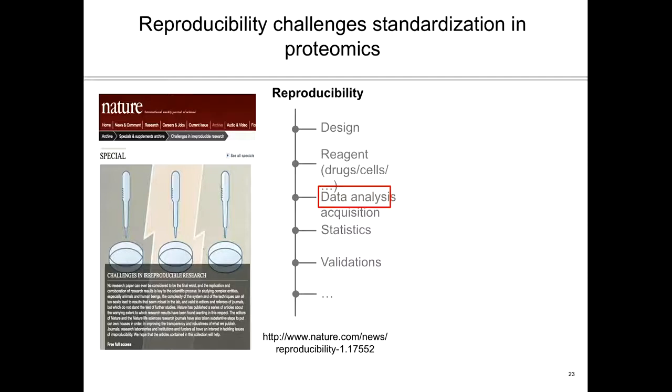So it was initially a very important step in the development of this DIA technique to ask, if we have a data set which has a ground truth in its composition, but also in its quantitative relationships of proteins, can the software tools that we have available find the same results from a specific data set?